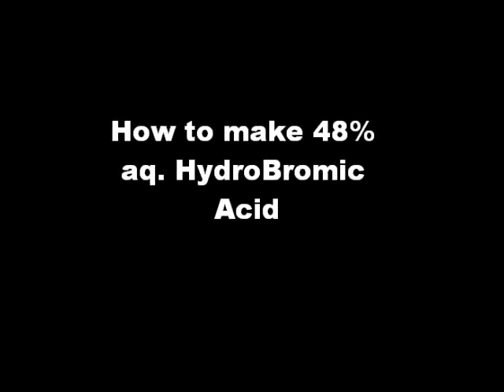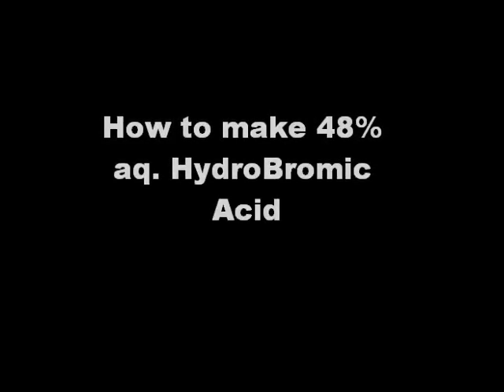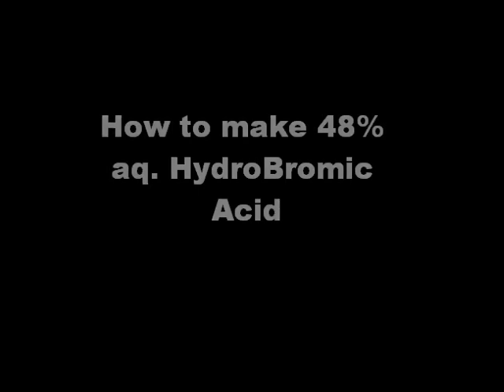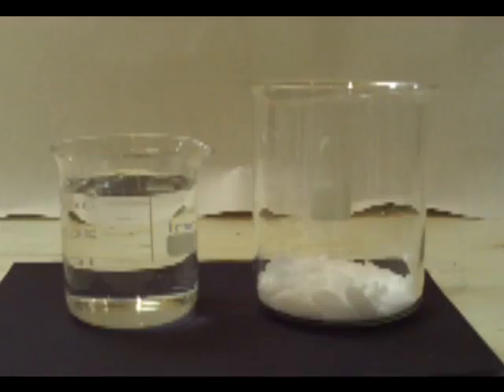For this experiment you're going to need basically two key ingredients and 400 milliliters of water. The first is potassium bromide, which is 240 grams, and the second is sulfuric acid at 180 milliliters. Of course you're making an acid, so please be very careful, wear proper gear, and try to do this in a fume hood or outside.